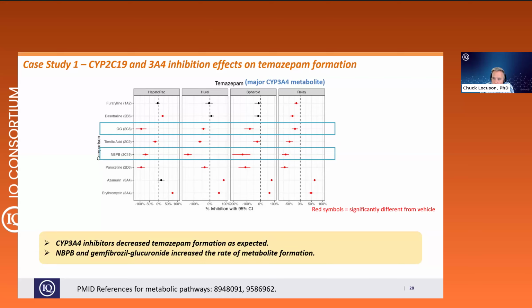If you peruse through the rest of this slide, you'll see some other cases where metabolite increased. This might be due to things like metabolic switching, or maybe changes in sequential metabolism that are occurring in the long-term incubations. But at this point, we're not going to speculate further. I think to really nail down and explain all of these findings, we'd need more extensive metabolite profiling. And as I mentioned earlier, we did not monitor all the secondary and tertiary pathways.